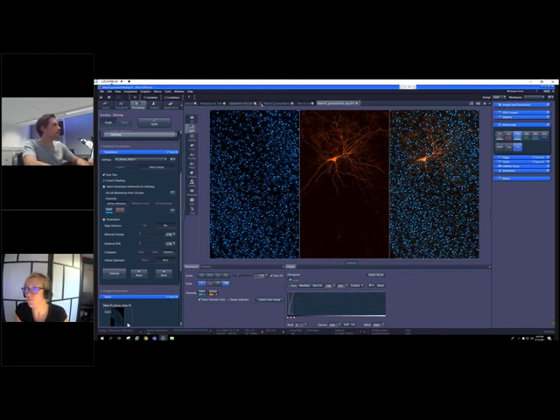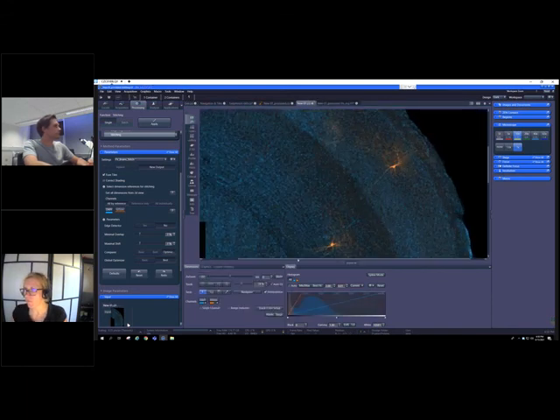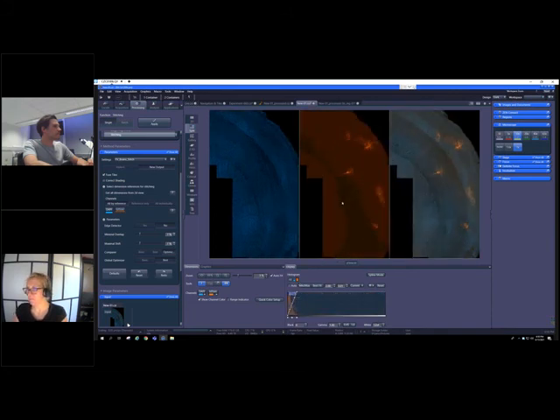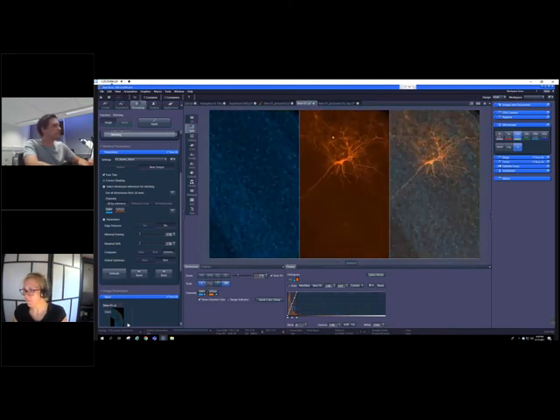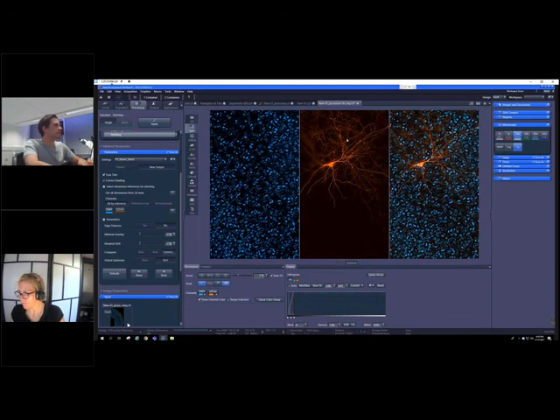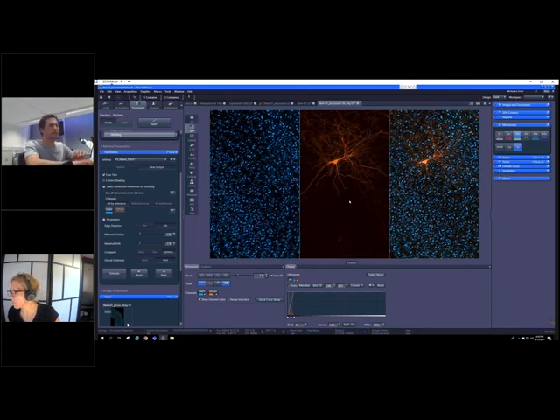But if you compare that over our initial wide field image, and this is what I'm showing here, you see that first of all, we have a much higher background overall. And secondly, also much more blur information in our image. And this is what we can easily remove to some extent using this online processing function, or also as an offline processing.